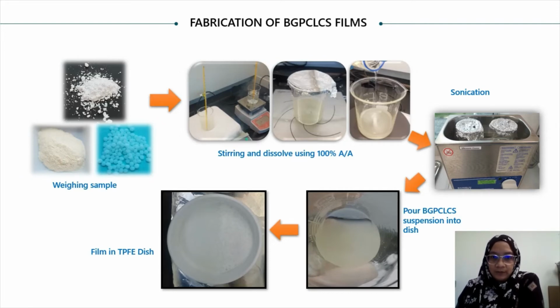In order to obtain a homogeneous solution, the mixture were dispersed via sonication and then continue with overnight stirring at 700 RPM and then pour inside a PTFE mold and left to dry for 72 hours. Once dry, the patch was removed from the mold and kept inside the desiccator until further tests.